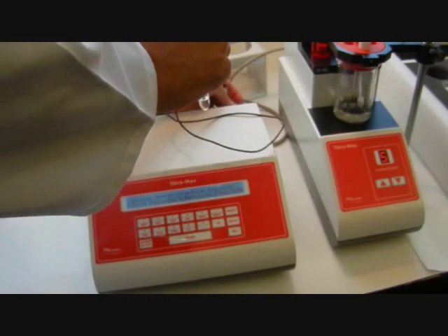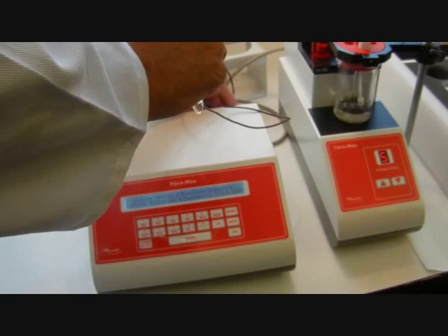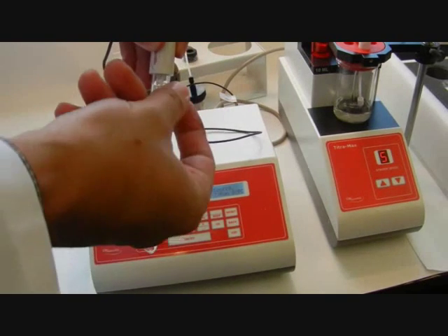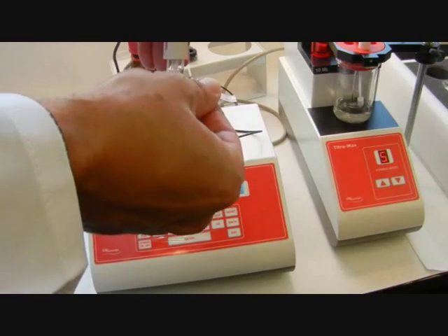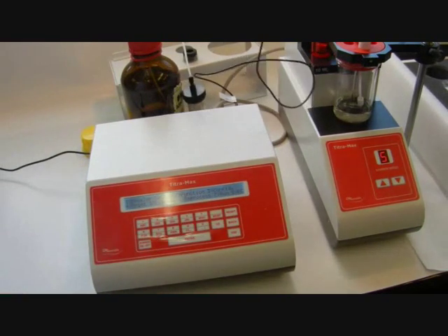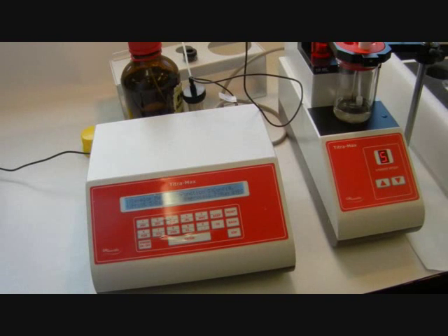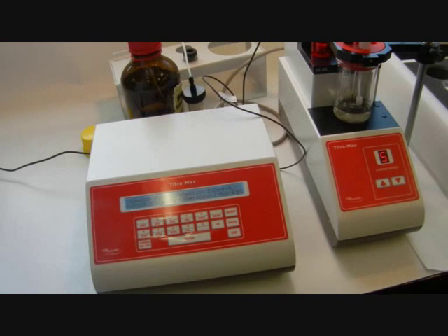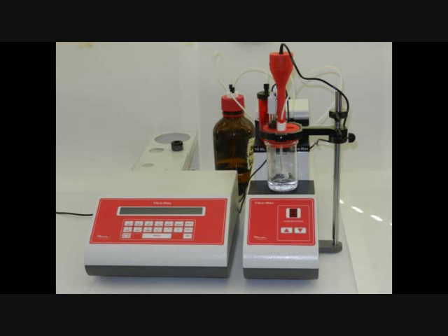Once it's doing that, we can get the electrode out and connect it to the back of the control unit. Take off the little black cap. This allows flow of filling solution through the electrode. We can put that in place on the titration stand. The Titramax is now primed.